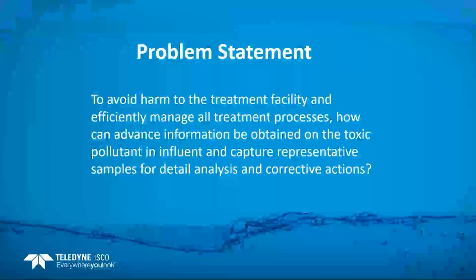So let's start with a problem statement. What we are trying to solve here is to avoid harm to the treatment facility and efficiently manage all treatment processes. And how can advanced information be obtained on the toxic pollutant in the influent, and representative samples captured for detailed analysis and corrective action?